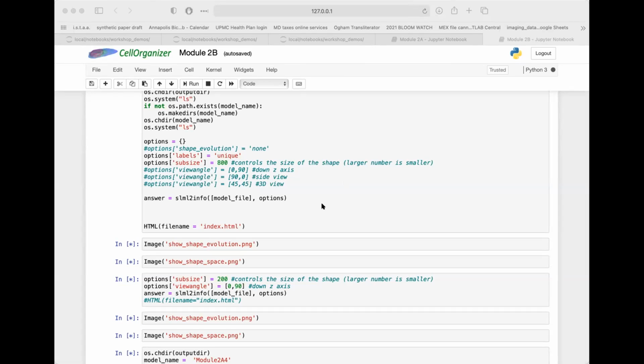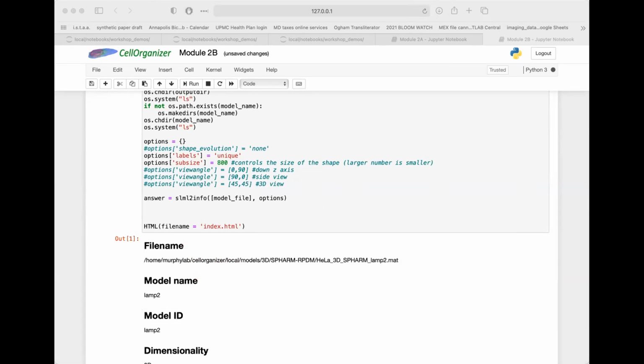Once you've done that, you have to run the notebook. Did you download files? I did download the file, so I clicked on it, and what it does is just downloading something, and that's it. It's only 1.27 KB. In your local folder, there should now be all of those folders like in mine, right? No, actually, I don't see them. That's the thing. I only see green.